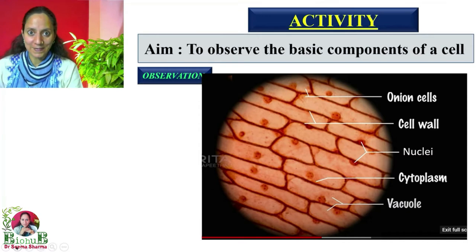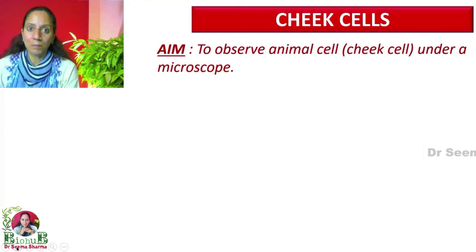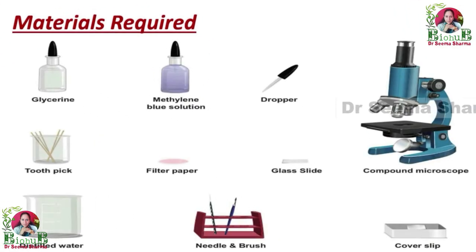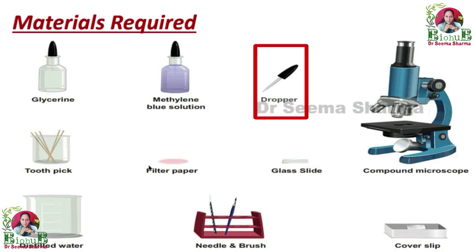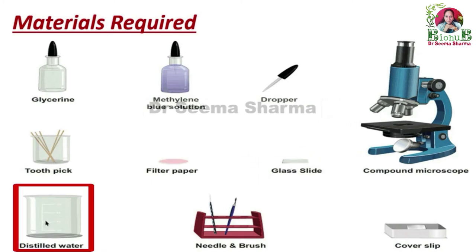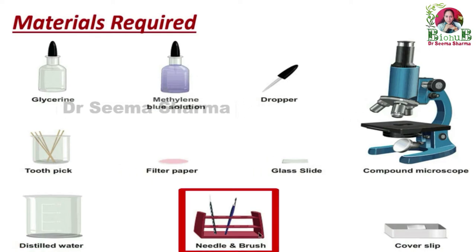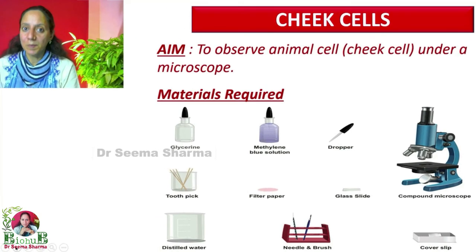These are the basic components of a plant cell. Now let's learn about the basic components of an animal cell. For that we are taking cheek cells. The aim is to observe an animal cell — cheek cell — under a compound microscope. Materials needed: glycerin, methylene blue, dropper, toothpicks, filter paper, glass slide, water (distilled or tap), needle, brushes, and a compound microscope.